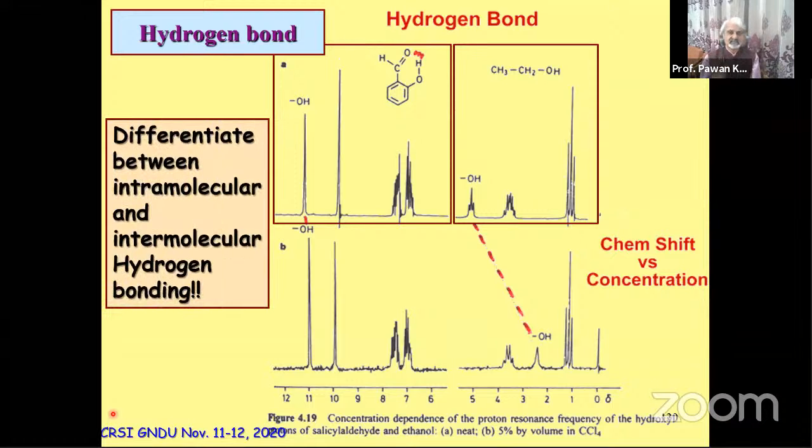So it's an excellent tool in the hands of the chemist to differentiate between intermolecular and intramolecular hydrogen bonding, which is not given in many books and which is not being taught to the level where I think it should be taught, because it's really a very simple tool.